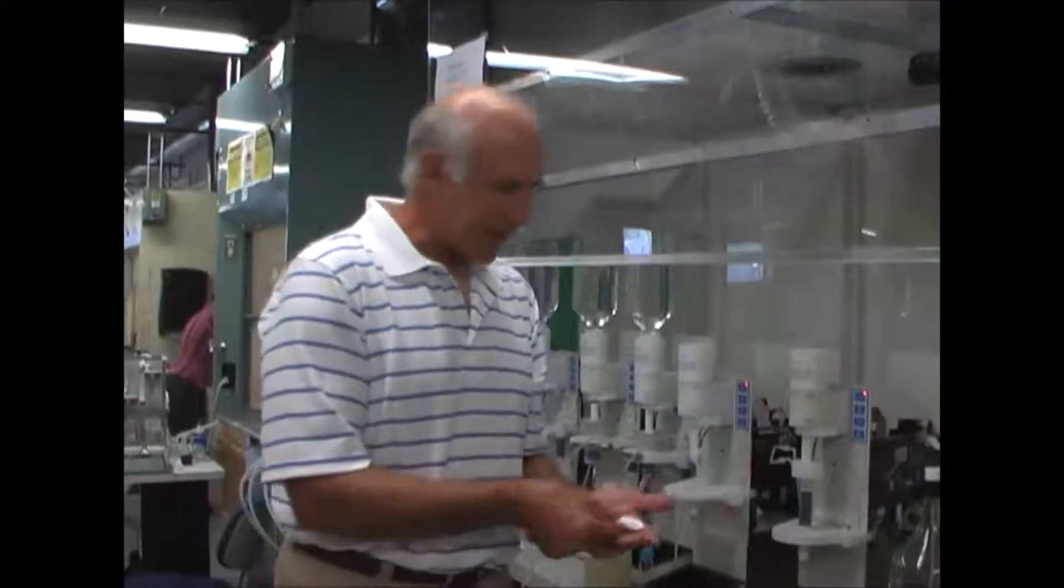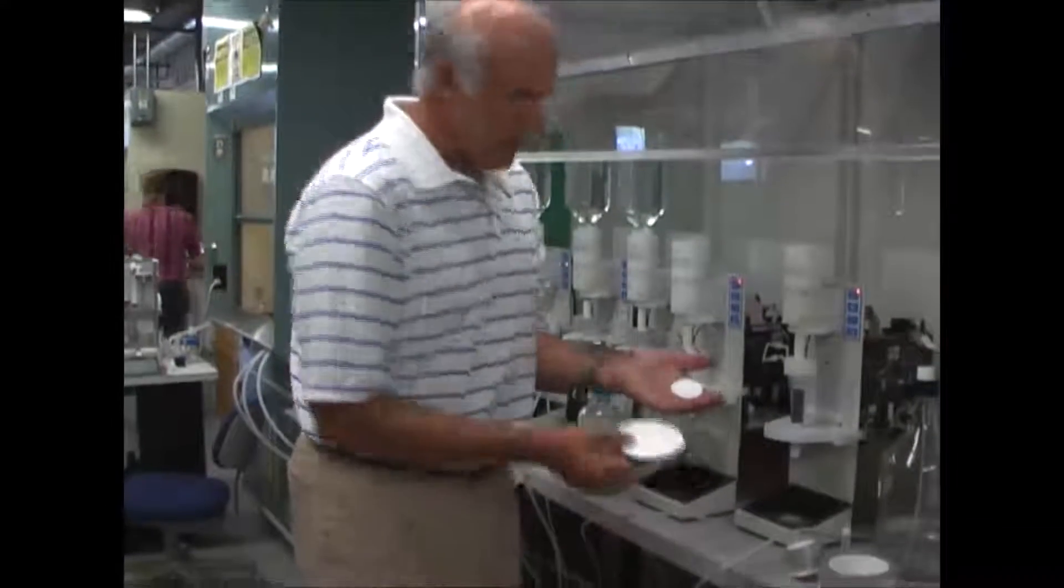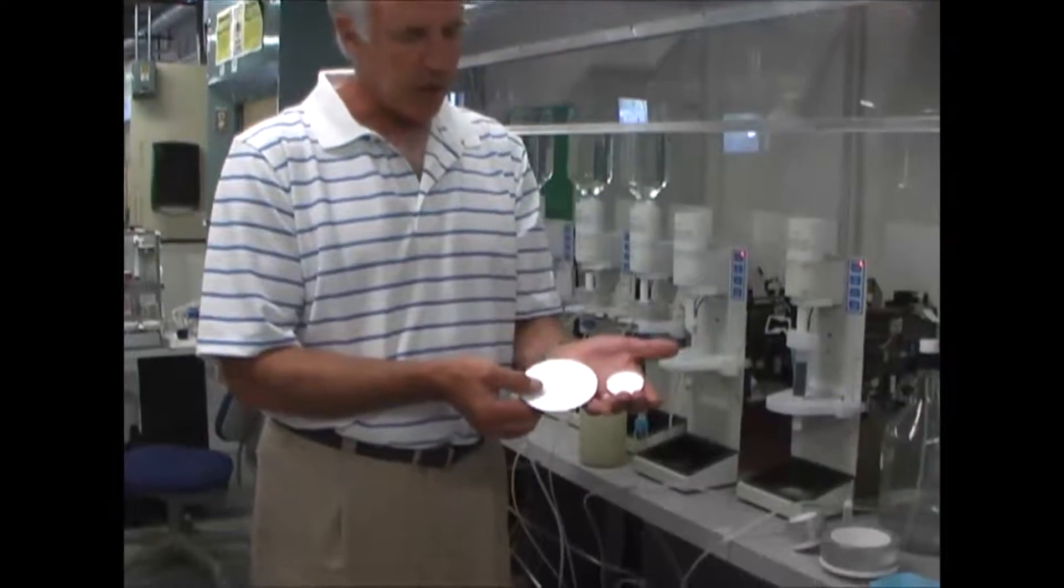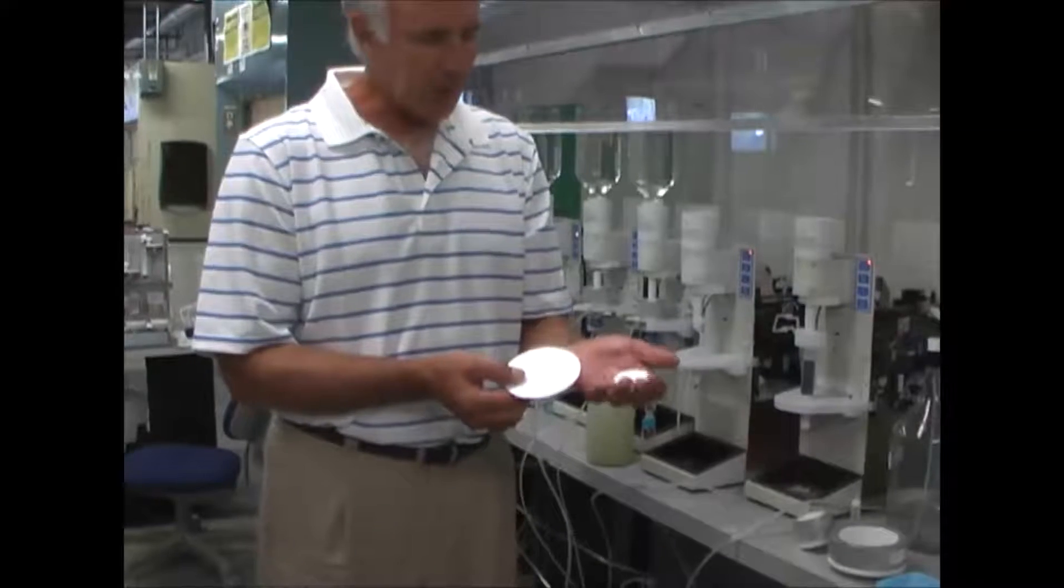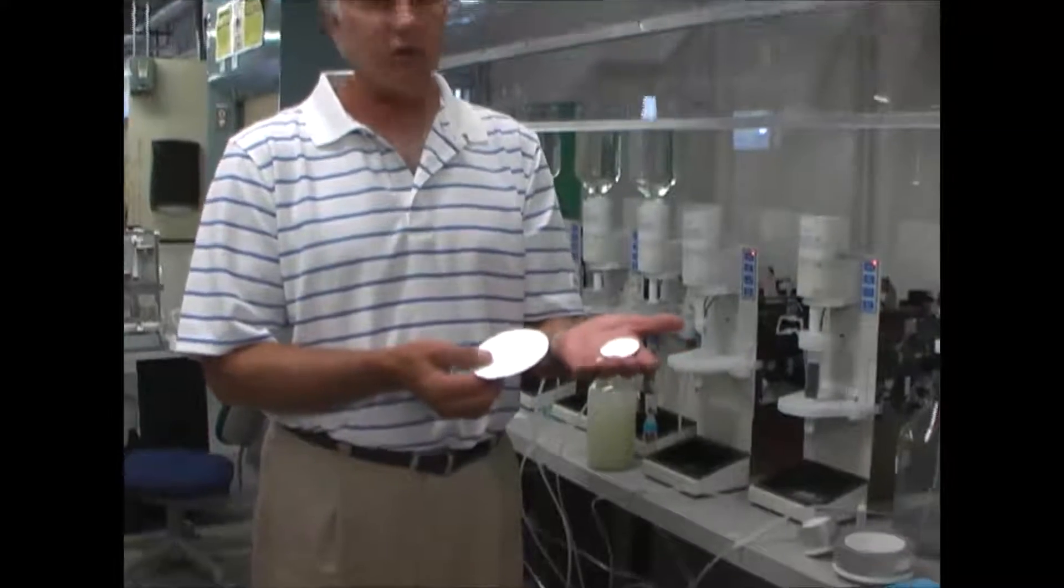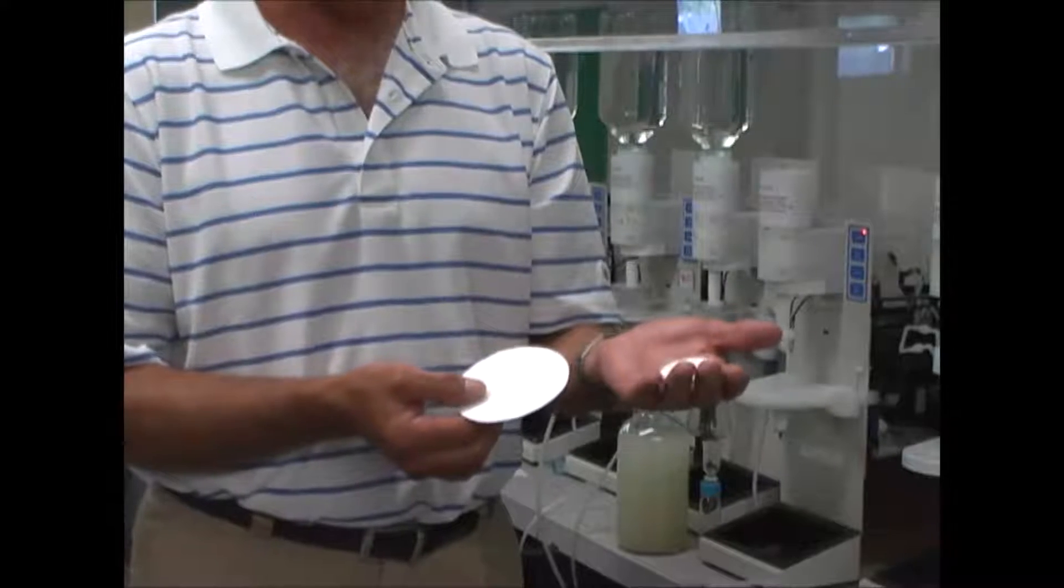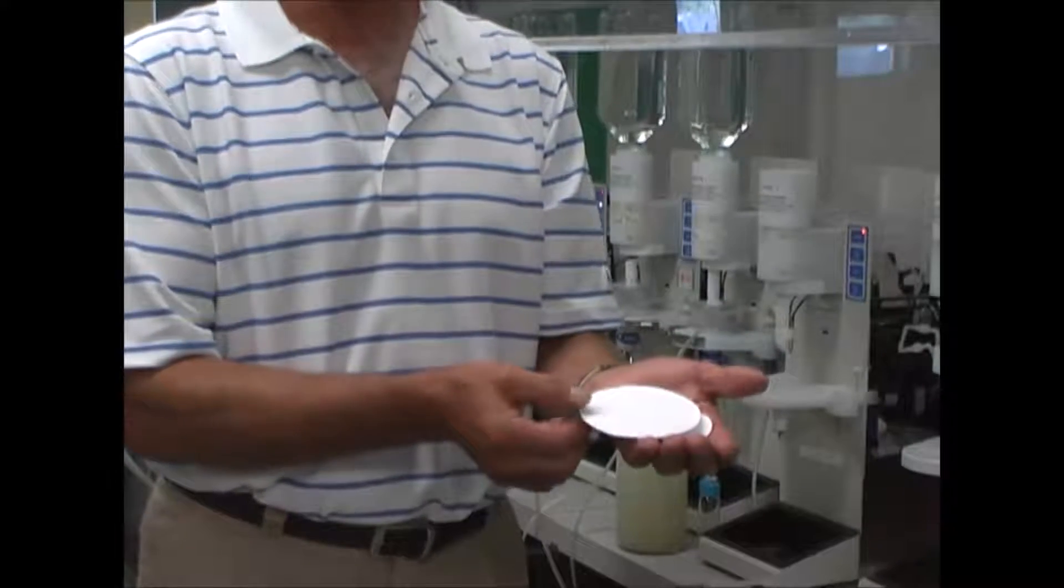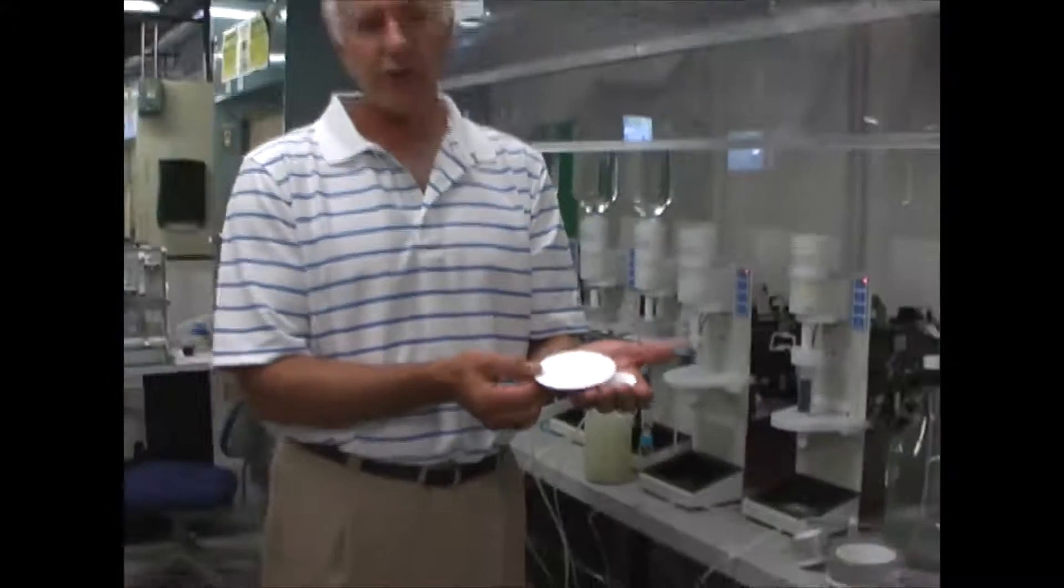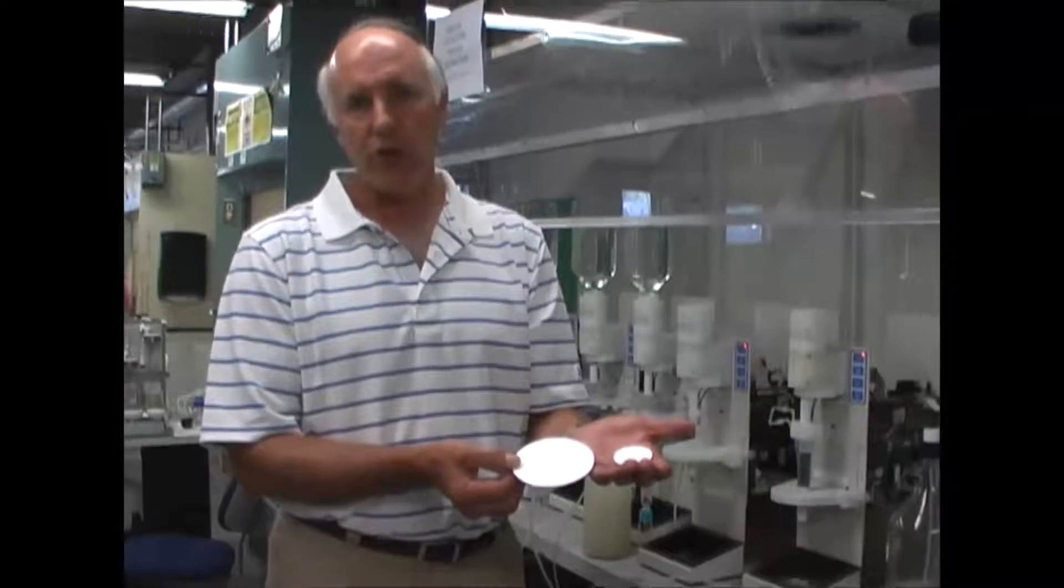This is a conventional 47 millimeter disc, and this is a 90 or 100 millimeter disc. The problem we've had in the past with handling dirty samples is fine particulate matter will plug a small disc. Therefore the conventional wisdom has always been to use a larger disc and get a significant increase in the surface area.